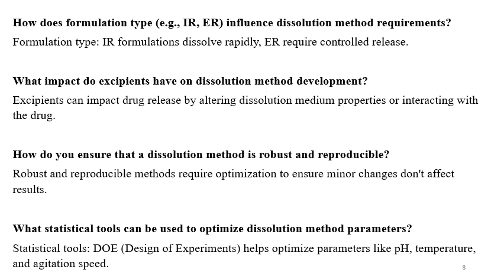So this question is very important for the analytical front. Robust and reproducible methods require optimization to ensure minor changes don't affect the results. So this is the best answer for this.